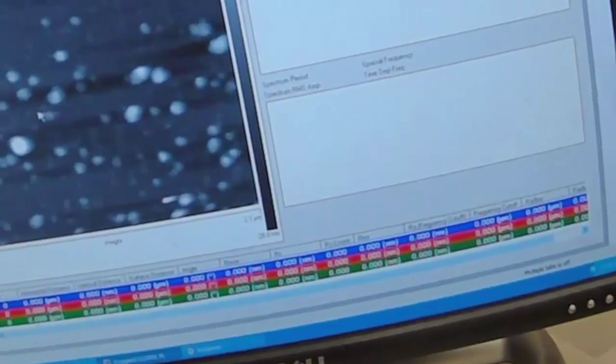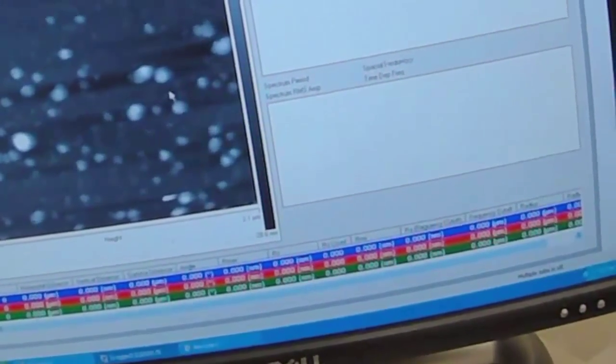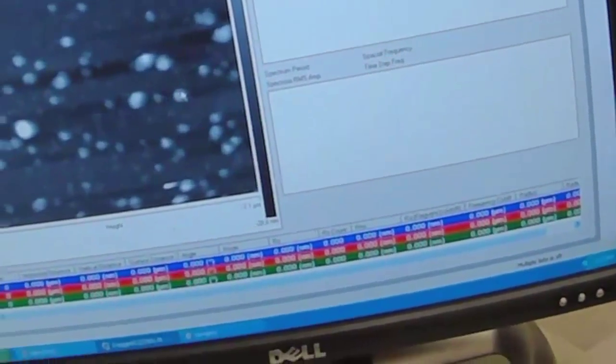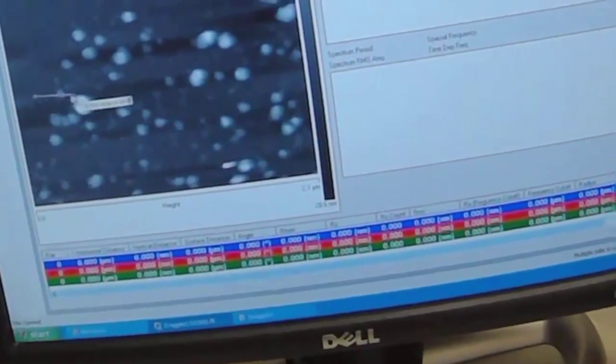We want to do a section or a profile. Okay, so what we're going to do is draw a line through the sample through a bunch of these spots like this.